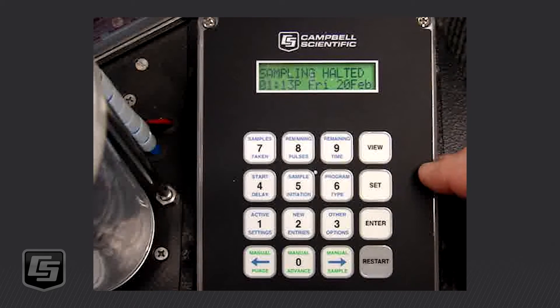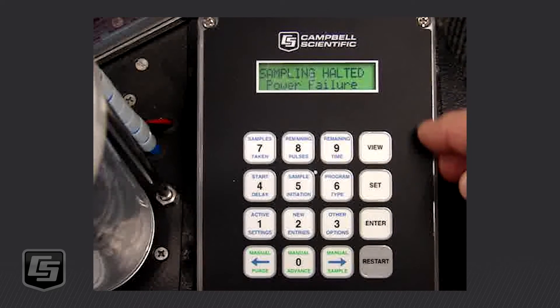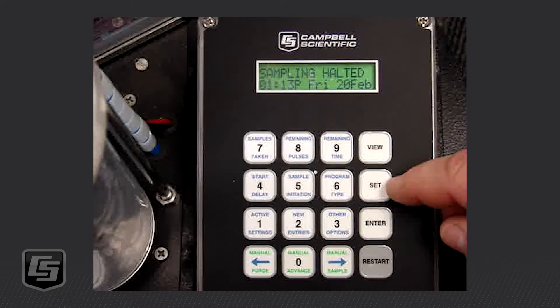When you first turn it on, you're going to see something come up that says 'Sampling Halted' or 'Power Failure,' or something similar. The first thing we want to do is look at it — when it comes up and if it shows the clock, see if that time is correct. If not, we want to check the clock and make sure it's set correctly.